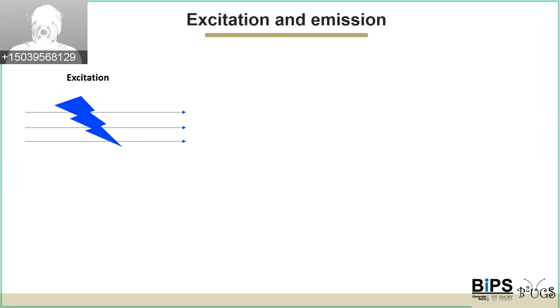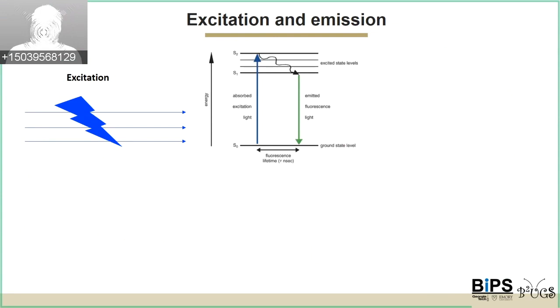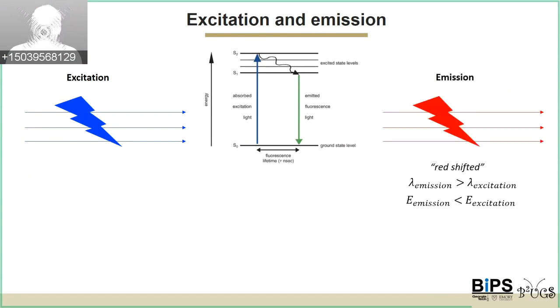So we will use this energy carrying property of light to achieve the fluorescence effect. First, incoming light, referred to as excitation light, enters the sample. Next, the fluorophores absorb this energy and enter what is called an excited state. This state is unstable, so some energy is released as heat in a process called thermal relaxation, and the fluorophore moves to a lower energy state. Then, this energy is emitted from the fluorophore as a photon.